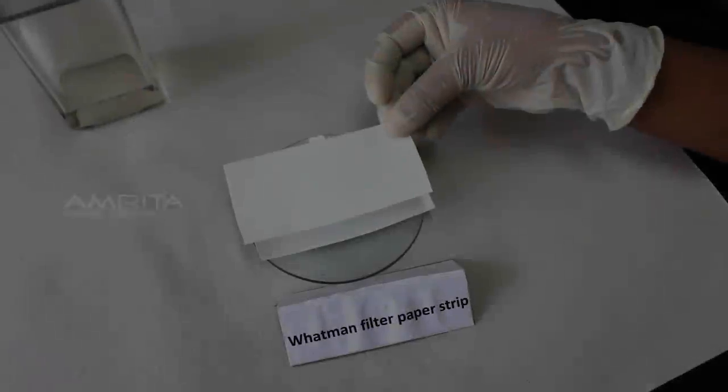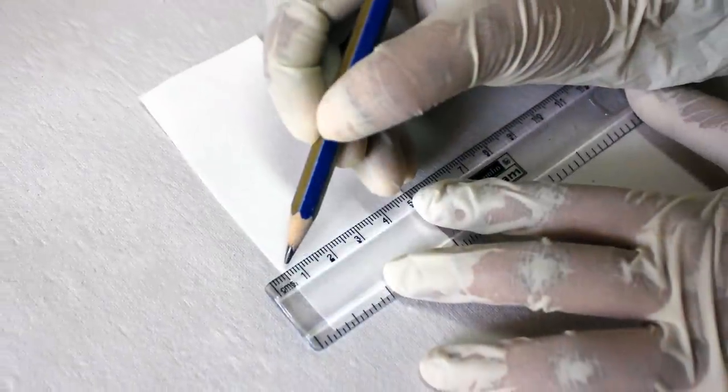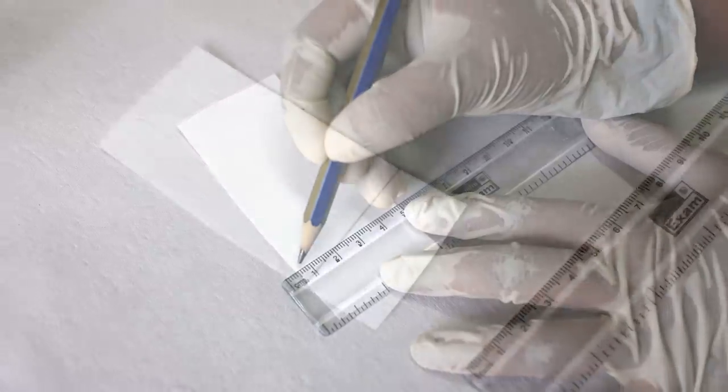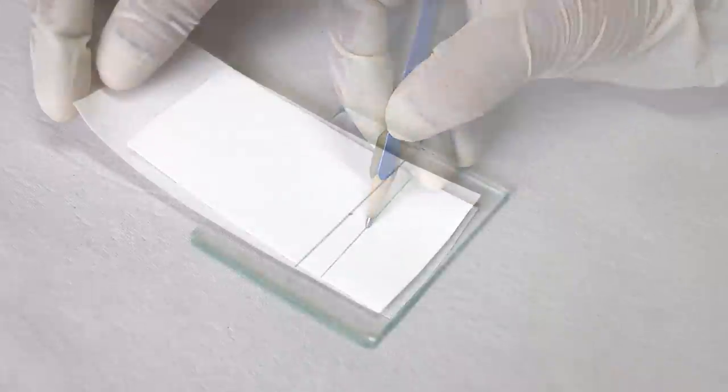Procedure: Take a Whatman filter paper strip and draw a line with a pencil above 2 cm from one end. Put a pencil mark at the center of the line.